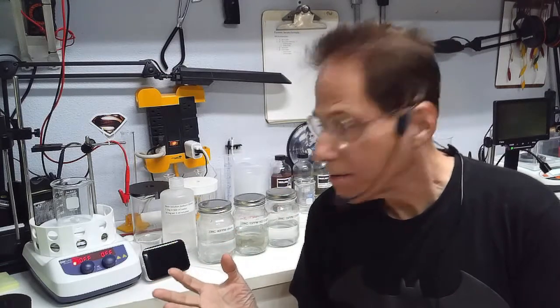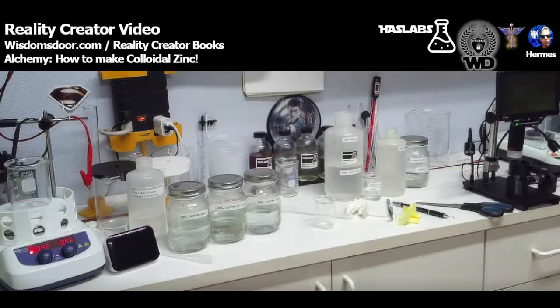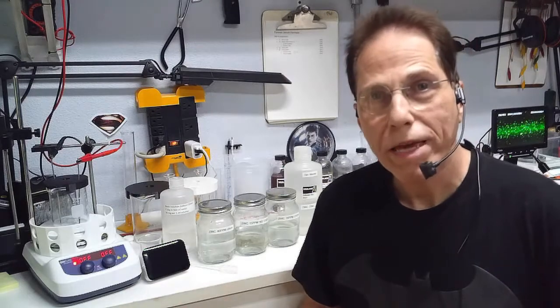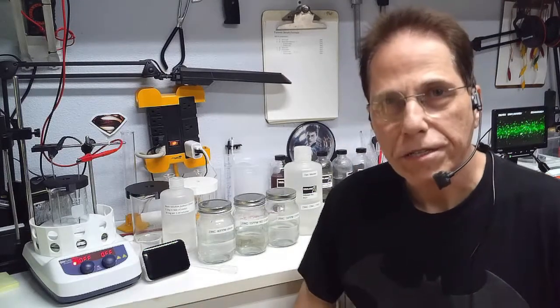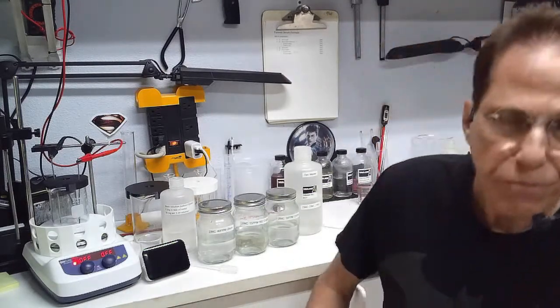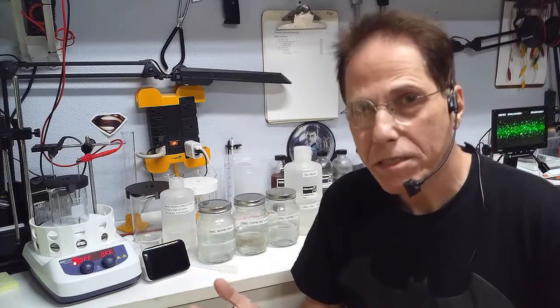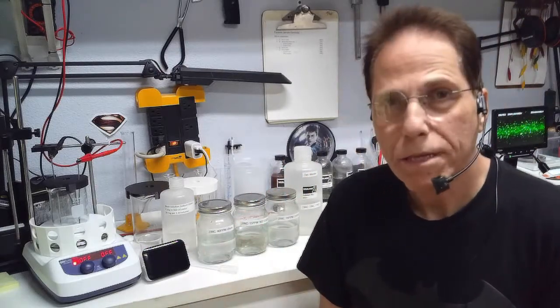Welcome to Reality Creative Video, I'm Hermes. Today we're gonna make colloidal zinc. Finally we're getting around to it. Silver is the easiest to make, zinc winds up being the next difficult.